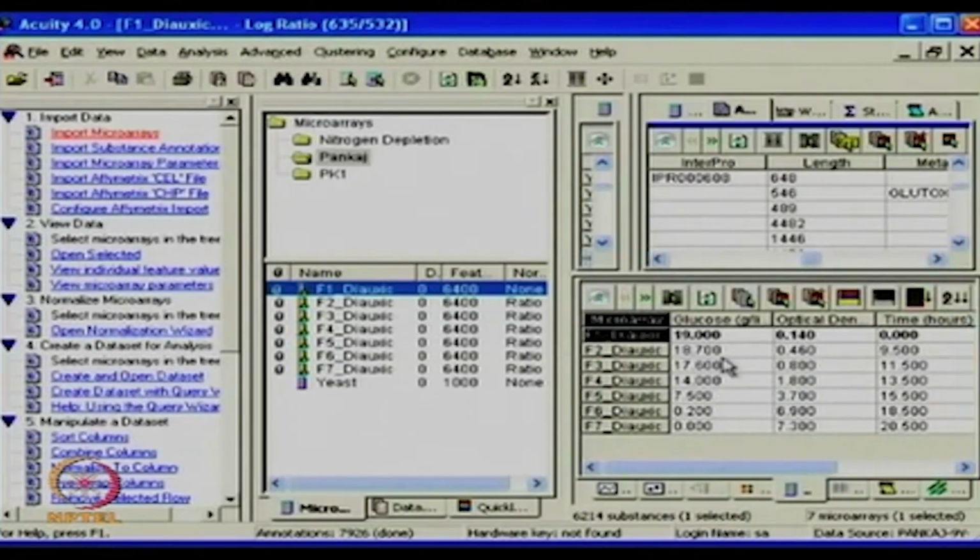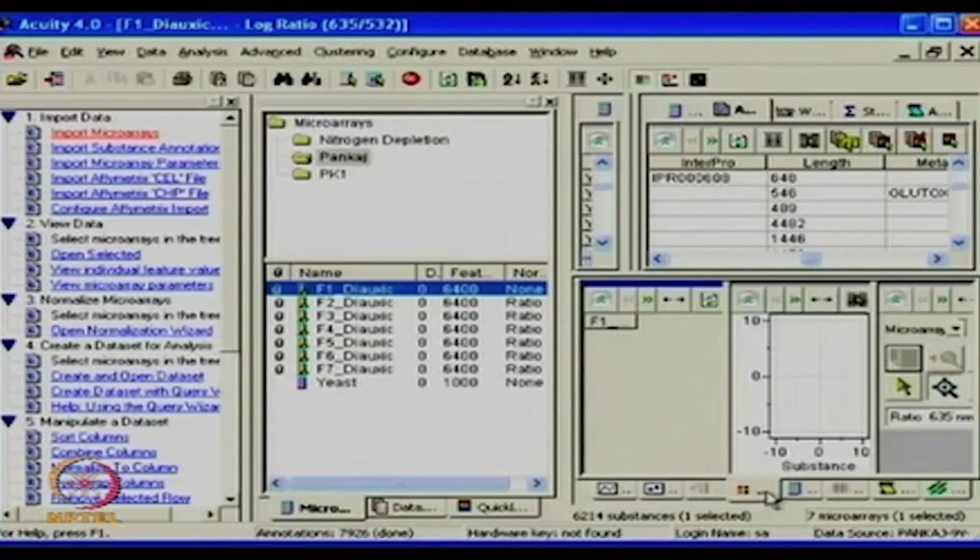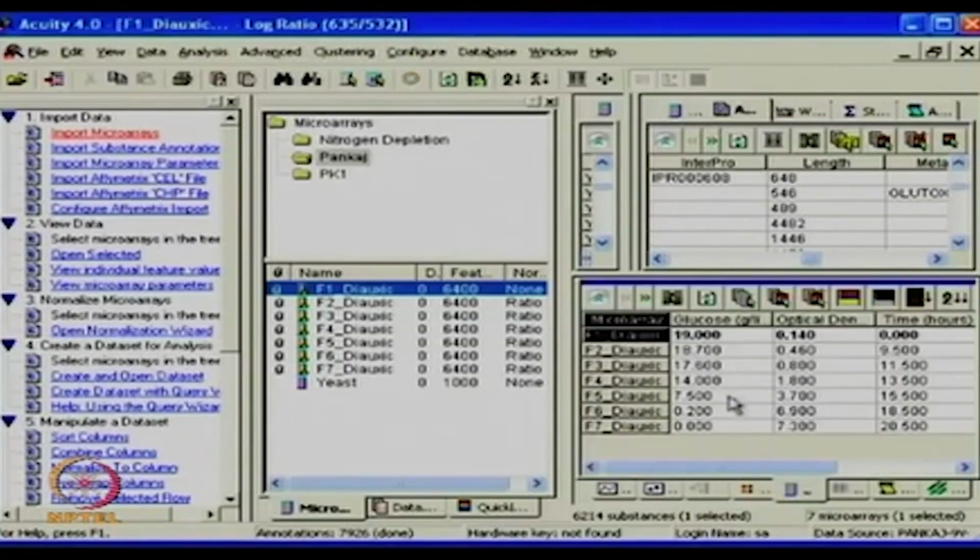In a few seconds more you will understand what each window means, but as it is, you can just switch over to different types and go to a parameter file and look at what details I have. Maybe you can briefly explain each of the tabs so that students are clear about what they can infer from each of these windows.